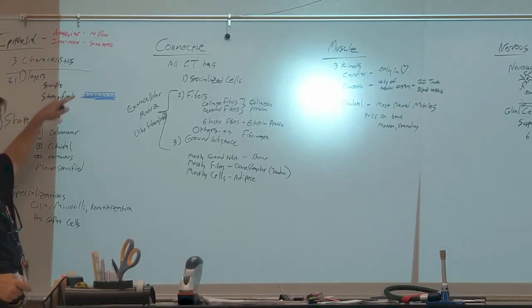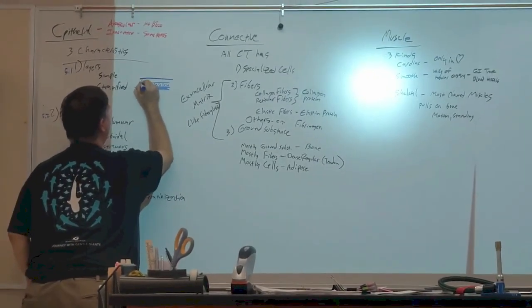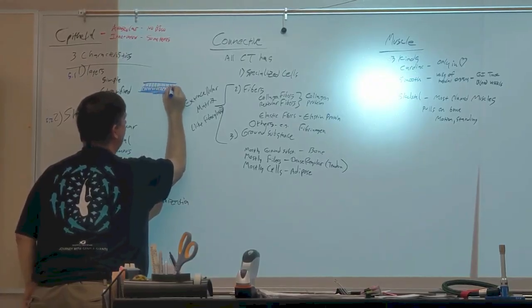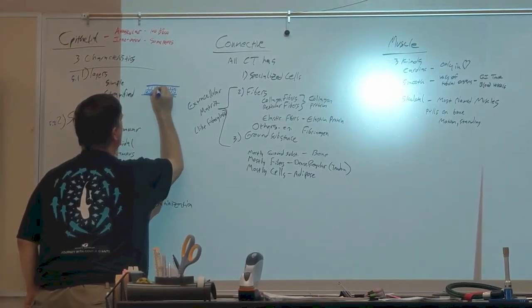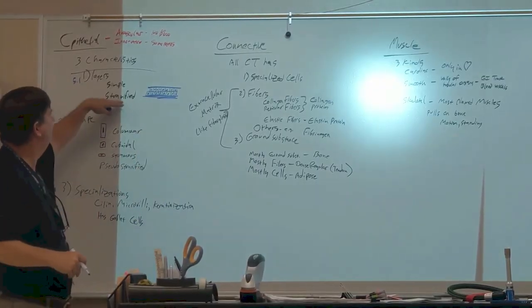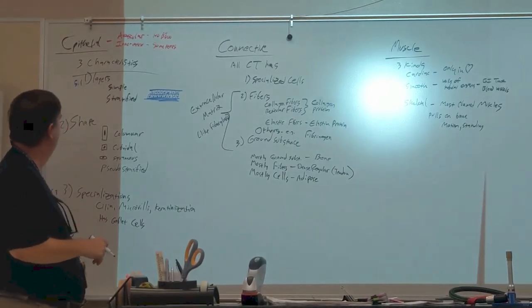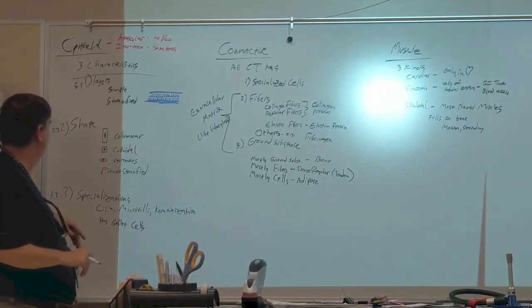Do you agree? Now, let's give it another layer. It might line up the same, they might line up differently, but we've got another layer of cells. If you have more than one layer, you're going to describe that tissue as stratified. Are you with me? Like geologic strata, layers of the rock, we've got layers of the tissue, it's stratified. All right, so simple or stratified, those are our two options in table 5.1.